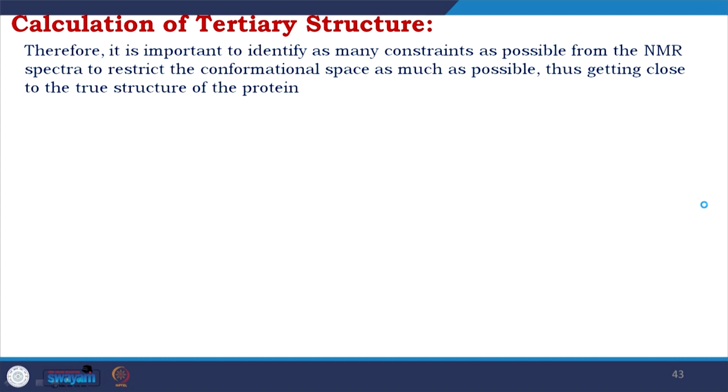When it is X-ray, you just get information, you connect the relations and you get the optimized structure. You might have multiple conformers in some of the atoms, but overall it is one thermodynamically stable conformation. Not in NMR, because it is in solution, they are not in fixed conformation, they are moving.